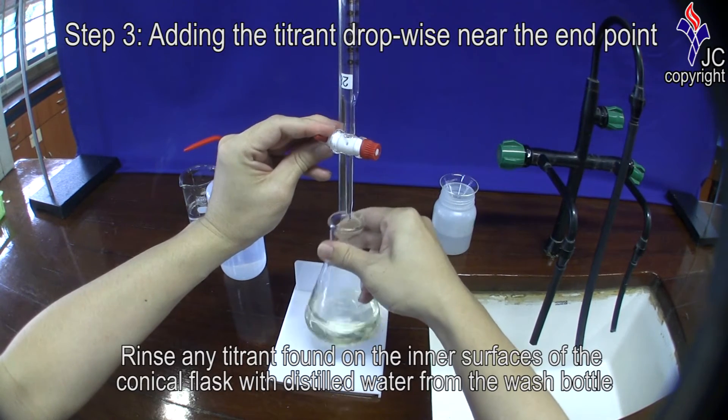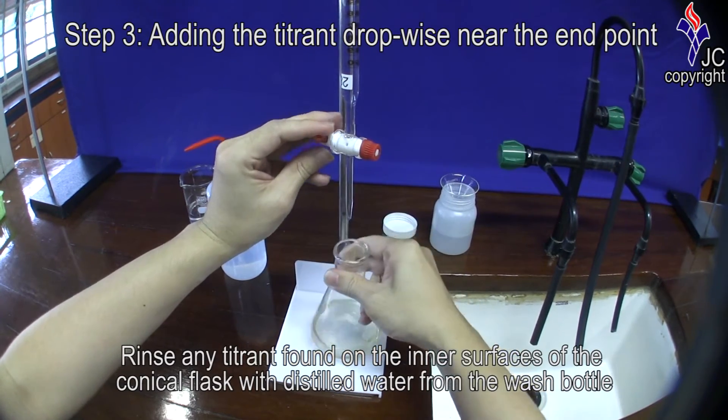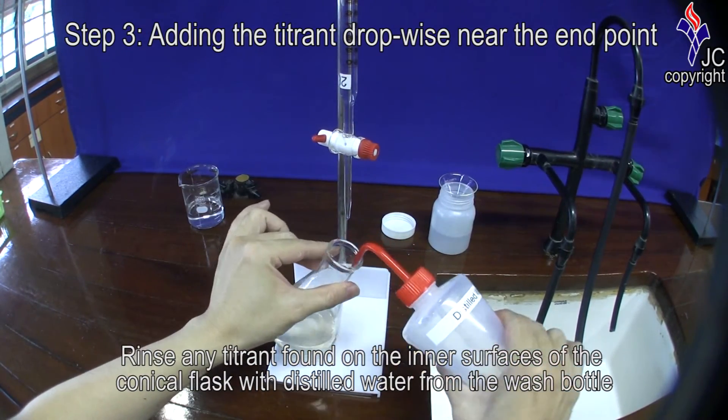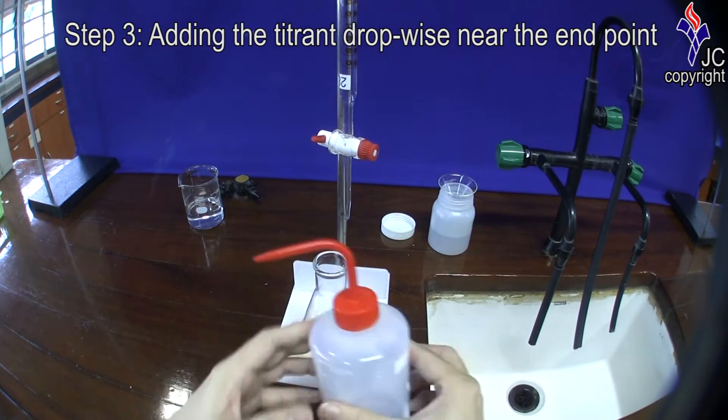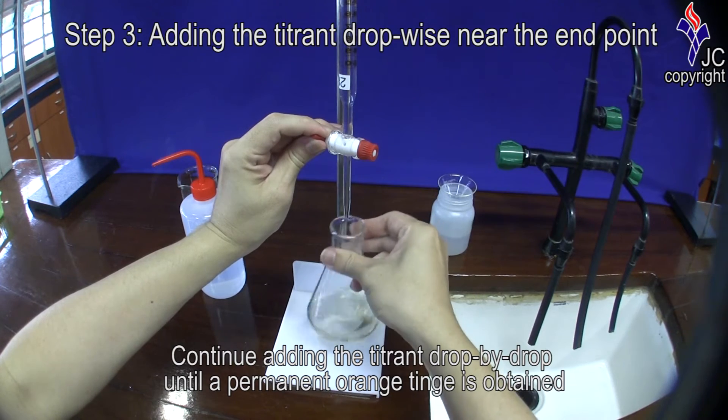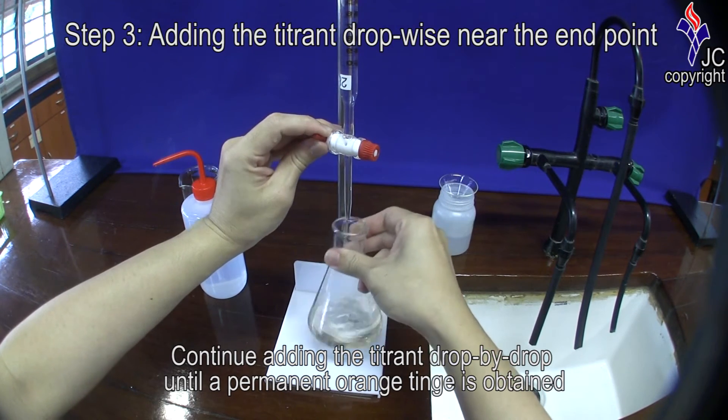Just before the end point, rinse any titrant found on the inner surfaces of the conical flask with distilled water from the wash bottle. Continue adding the titrant drop-by-drop until a permanent orange tinge is obtained.